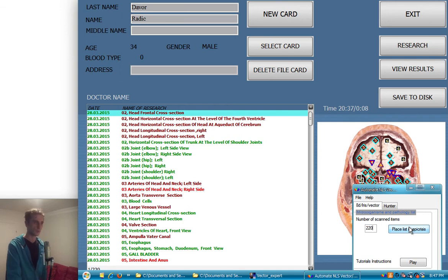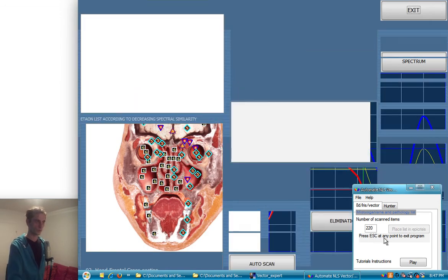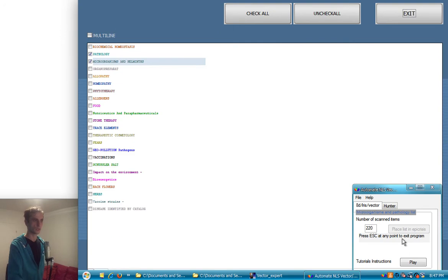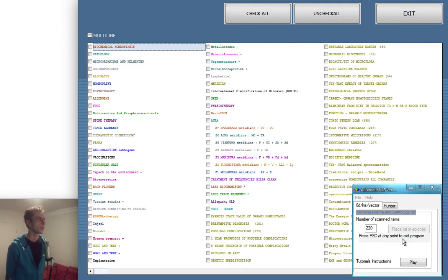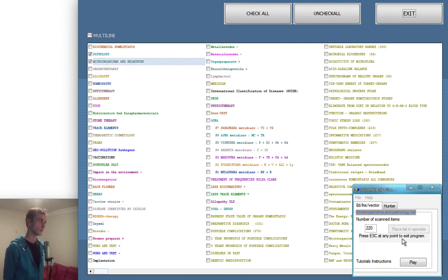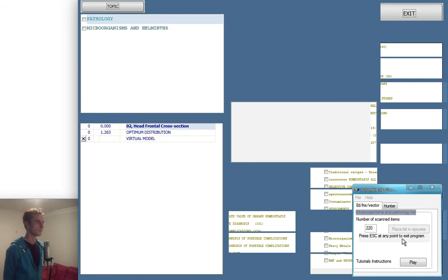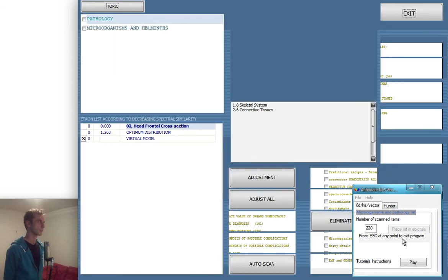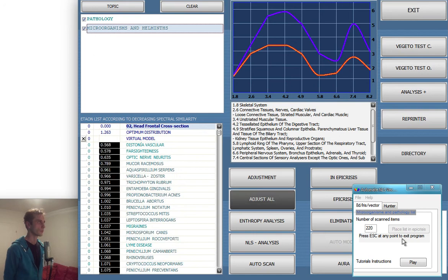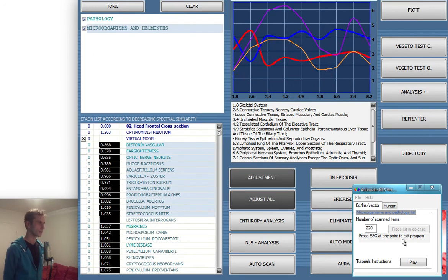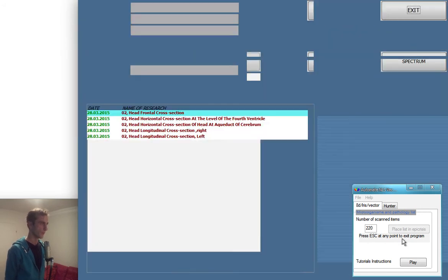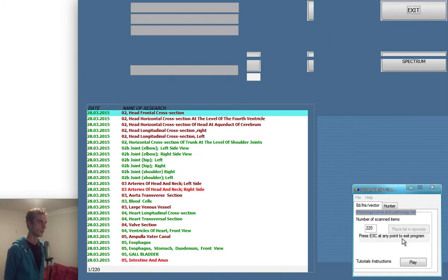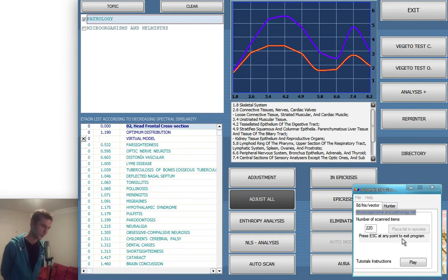So you hit the button and it goes. You also have the press escape button at any point to exit the program and it will exit. Now it checks the pathology, microorganisms and helminths. It clicks on this thing, doing only first time to release some software intensity, then it goes to pathology microorganisms, then adjust all, selects the first 20 parts, 20 things, and then it sets it into the epicrisis.